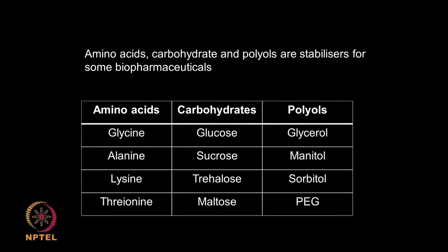So, today we talked about a mixture of downstream activities. Generally these downstream activities are resorted to at the end of the operation, that means at the end, with the purified product, either I want to make the product into a solid and then dry it using temperature, or lyophilize it at low temperature, so that I end up with a solid product.